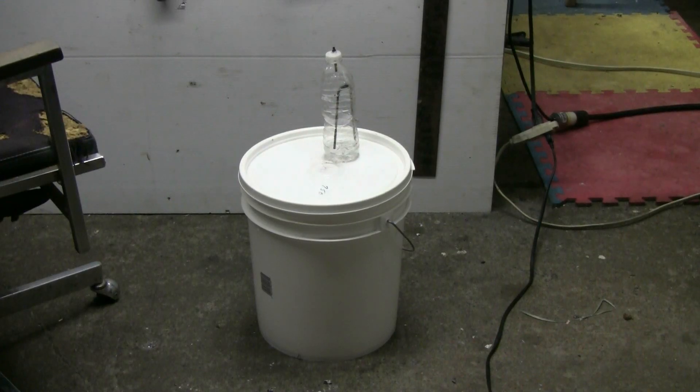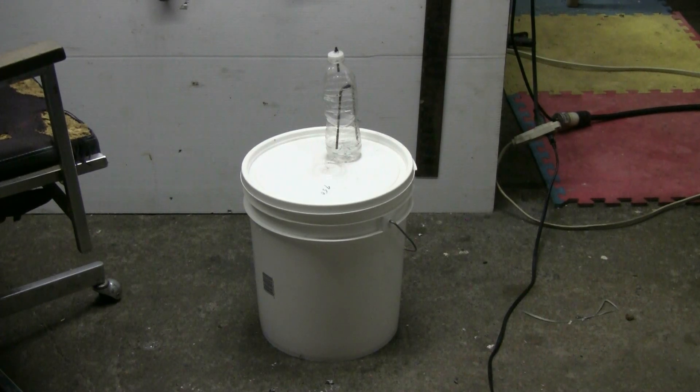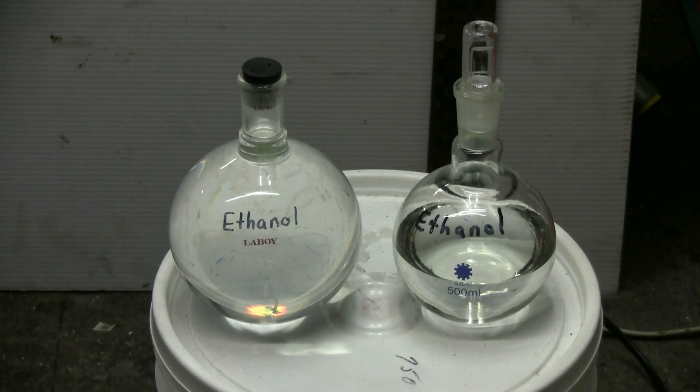To get the mash that I'm distilling in the big still, I took a 5-gallon pail, sterilized it, put in about 4 gallons of water, about 5 pounds of sugar, and some yeast, let it ferment for about a week, and that produced the mash I'm getting my ethanol from. That ethanol run produced a fair bit of crude ethanol — I completely filled the 1-liter boiling flask on the left and half-filled the 500 milliliter boiling flask on the right. This ethanol will have to be re-distilled to clean it up, purify it, and eliminate the water that came over in the first distillation, but it's still pretty good.